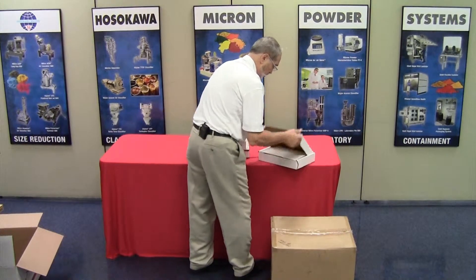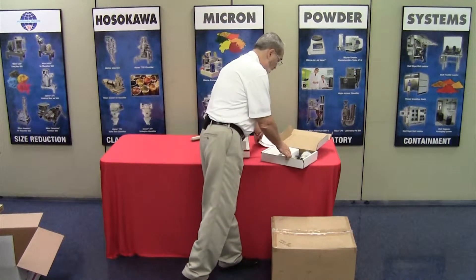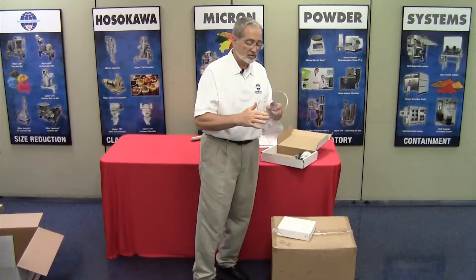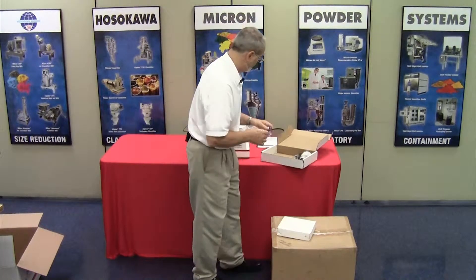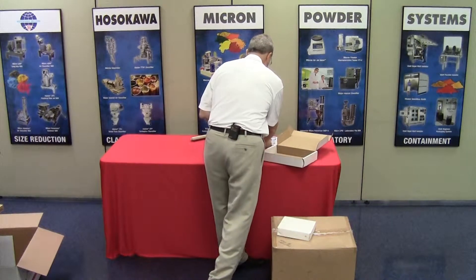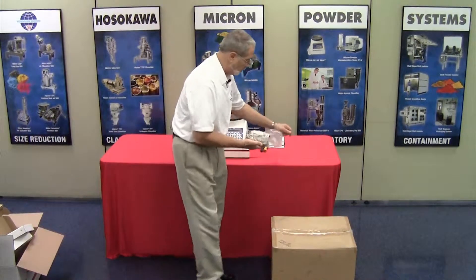Next, open your accessory box. In the accessory box is the operations manual. You also have a sieve screen cover — in some cases the sieve screen cover has a protective coating on it, so please remove the protective coating. You will also have a sieve brush and a tapping hammer. And lastly, but most importantly, is the wand.